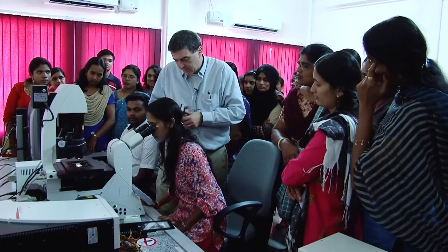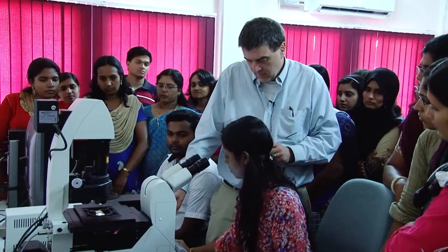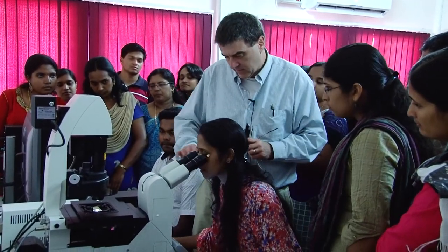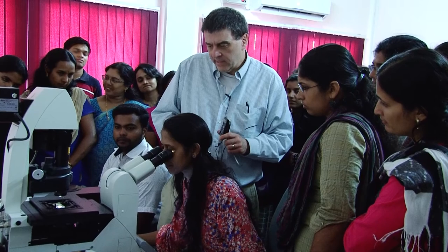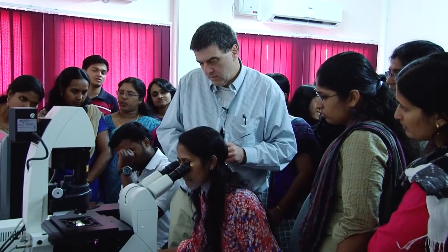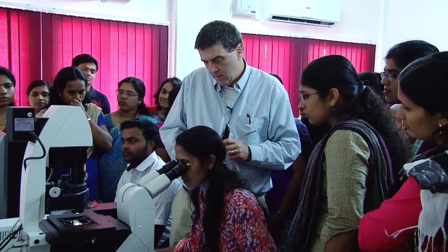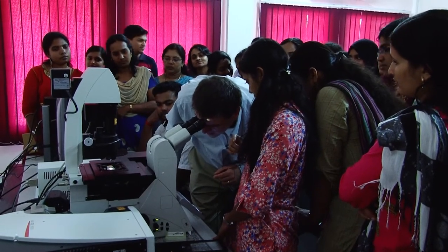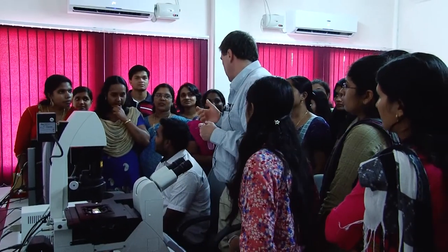Okay, so pick something. This is your X and Y. So move it around and find something you like, okay? This is X and Y, this is focus. So try to find one that looks interesting. These are marine diatoms. Did you find an interesting one? Okay, so yeah. What is this? These are diatoms. Does anybody know what diatoms are?